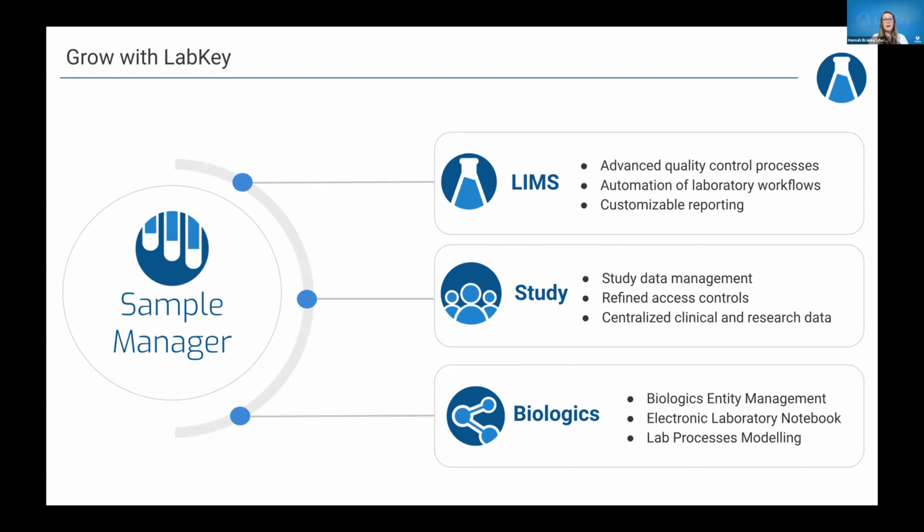Continuing our support with LabKey Study and being able to manage that study data, continuing to refine those access controls and really have that centralized clinical and research data.